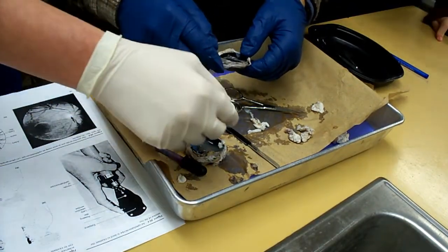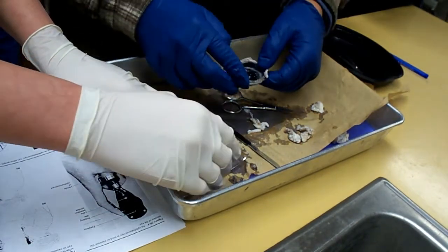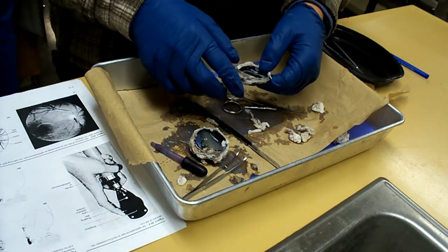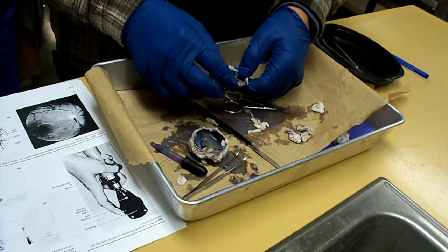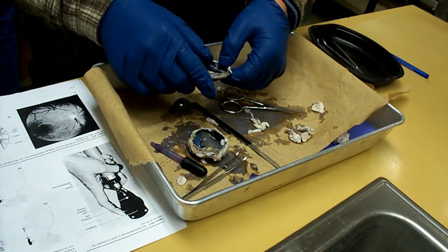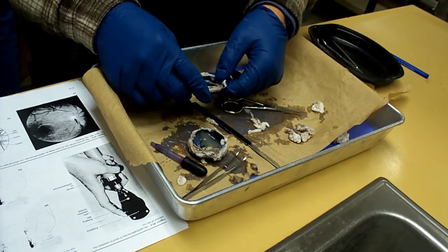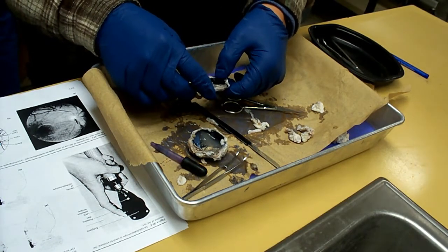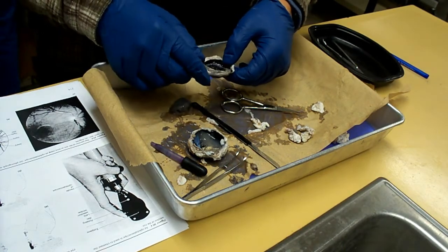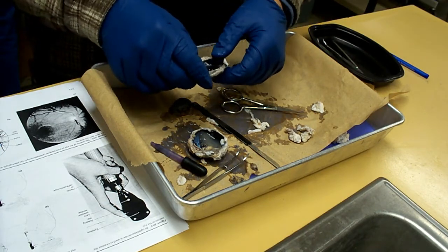It's like those Christmas presents you can never open. Can I have your attention for a second? The ciliary bodies that you see when you cut open the eyeball — listen up — the ciliary bodies that are next to the iris are attached to the lens. But when you cut it open, guys, and this thing's been in formalin, what happens is it detaches. That's why it's not attached to the lens.